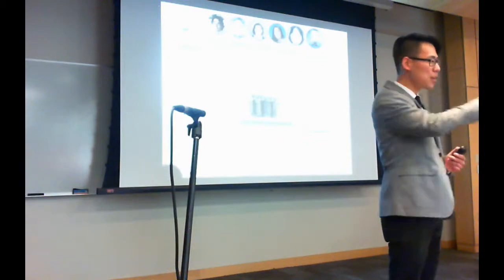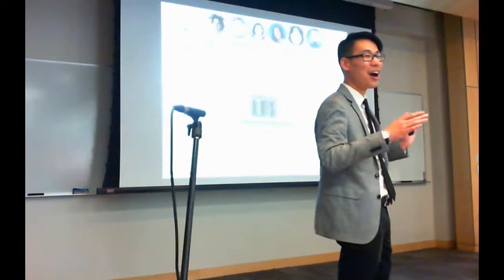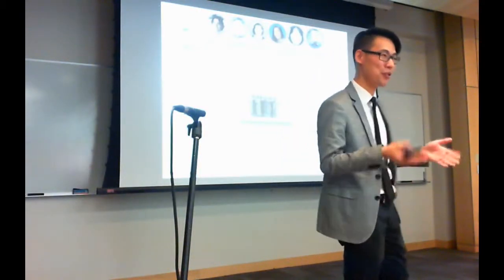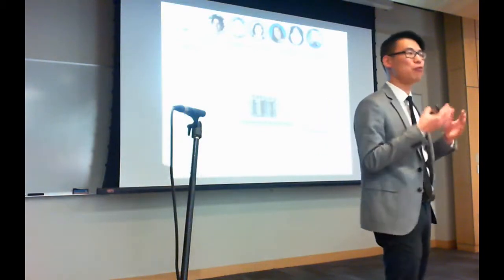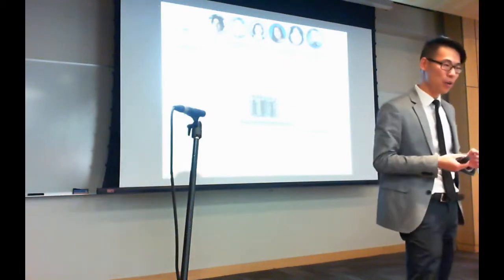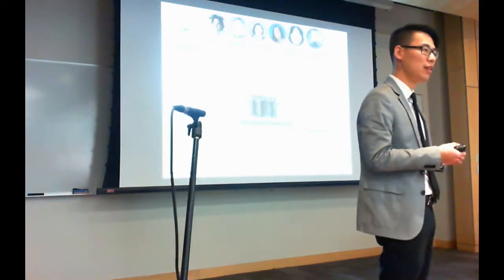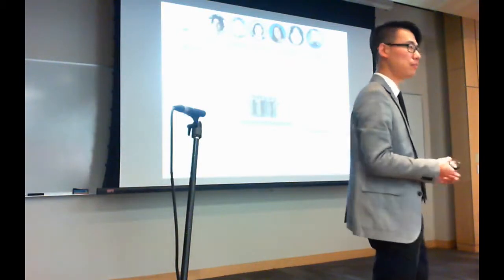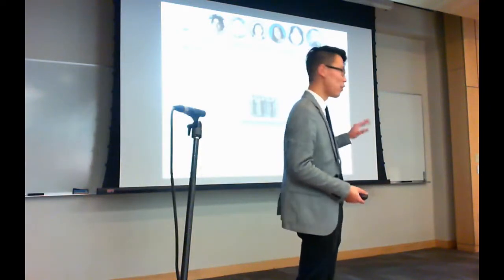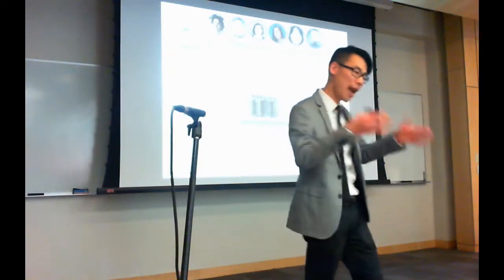Together with Peter, Nuno, Vanessa, Laura, Yao, Jeremy, and then 120 other authors, we worked together to create this platform called GNPS. This platform allows the crowdsourcing of these spectral libraries. If a scientist out there in the world spent months or years identifying a compound they really care about, let them share that with the world. And to date, we've had about 19,000 MS/MS spectra from nearly 11,000 compounds, and 91 contributors add to this library resource.